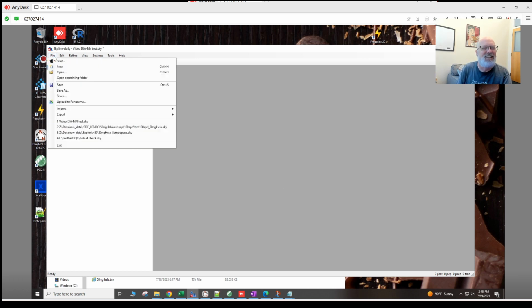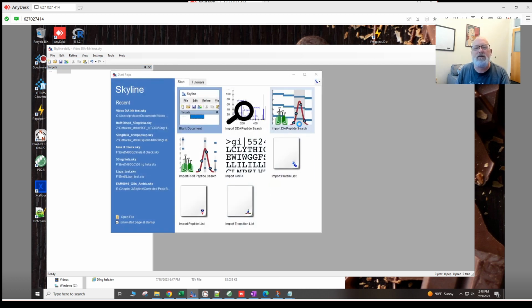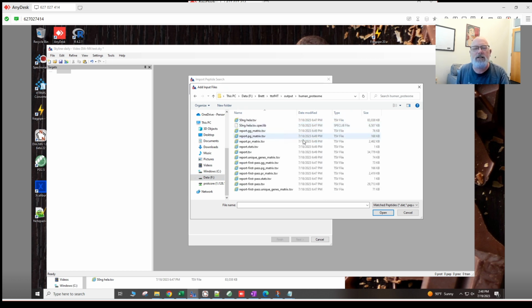All right, let's try again. All right, it takes me a few times. Yes, so let's try again. Import DIA peptide search. Let's see, you guys can laugh at me while I do this because it takes me a few times. HT, output, proteome. What did I do wrong? I think I did that correctly. So that's TSV. Proteome. Did I do that right? It should have been. Let's see. Report. Oh, I did it on the wrong directory. That's what I did. Okay.